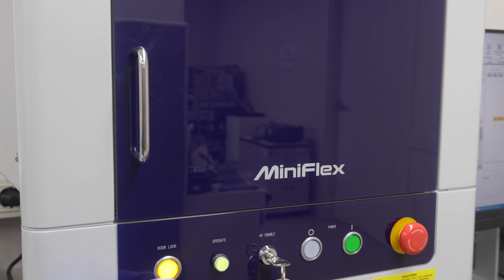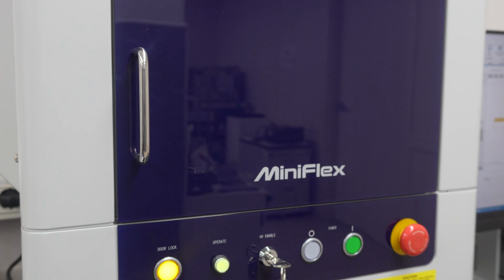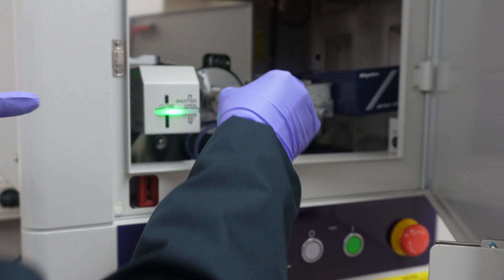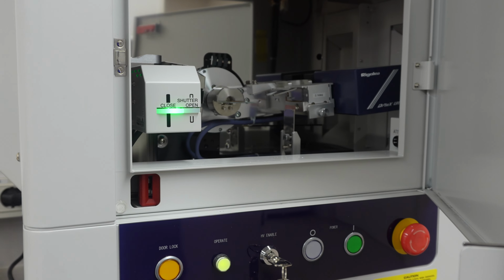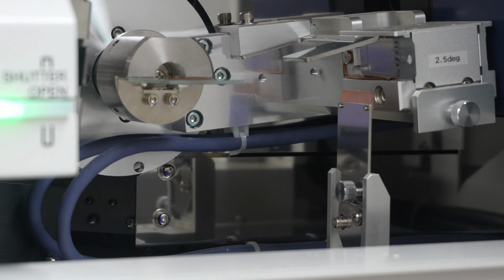Press again the door button when you want to take out your sample. For the second sample, which is the powder sample, the step is the same. First, you press the button until blinking, and then input your sample. One of the edge will be held by the slit in the chamber, so make sure you do it properly. I will show you how it looks. And then close the chamber and press again the door button.